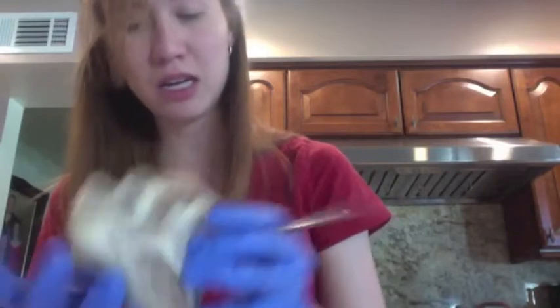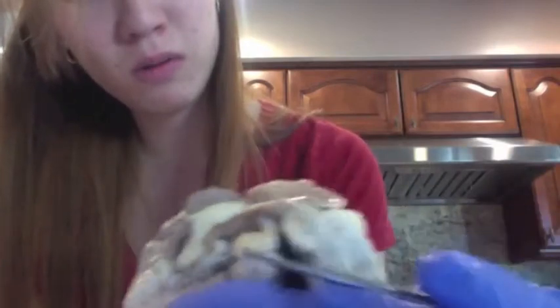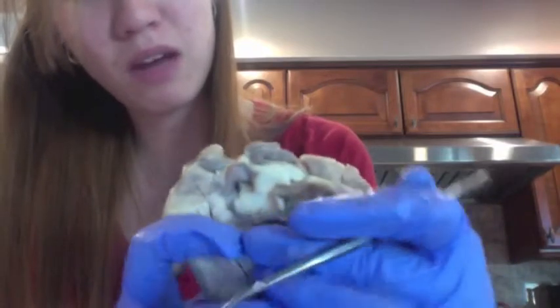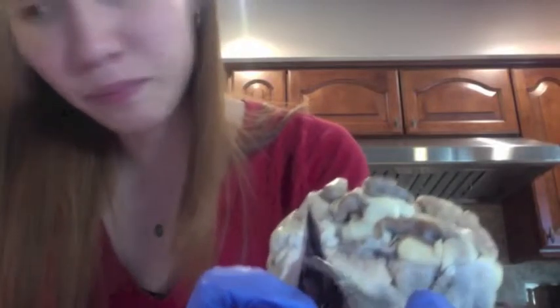We have the bicuspid valve in the left valve, which is, not enough light, this right there would be the bicuspid valve. And we have the tricuspid valve right up in there.